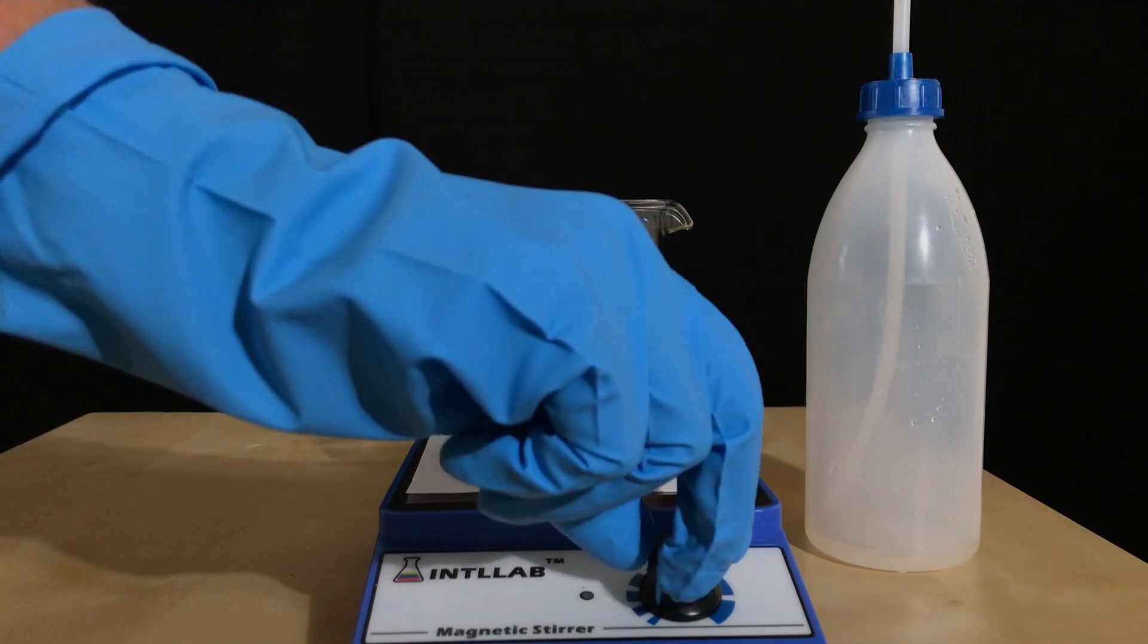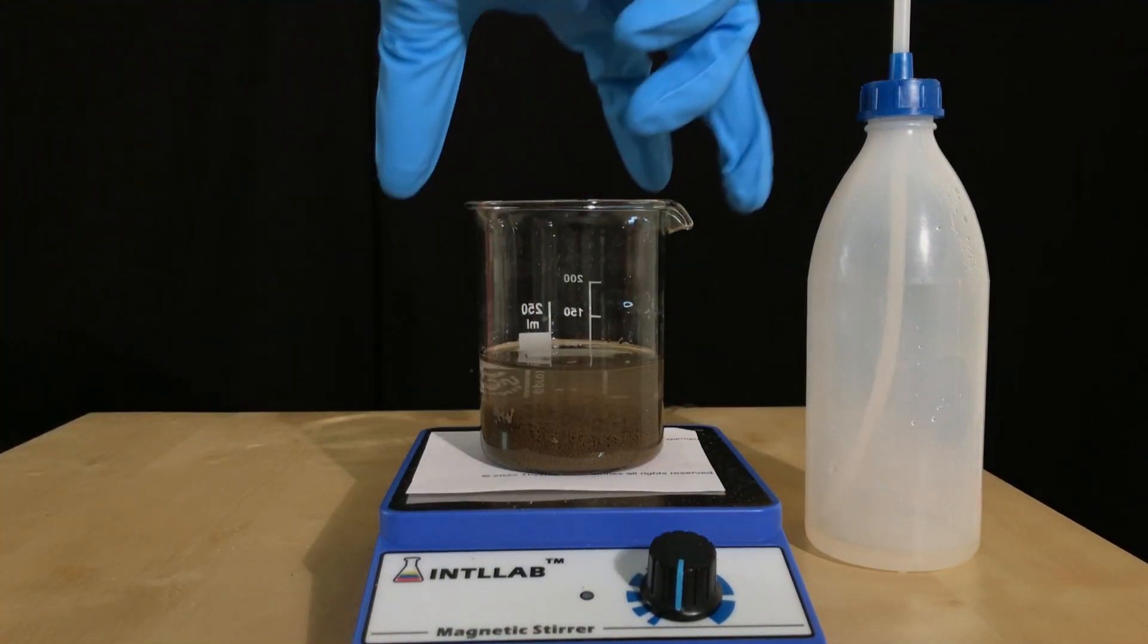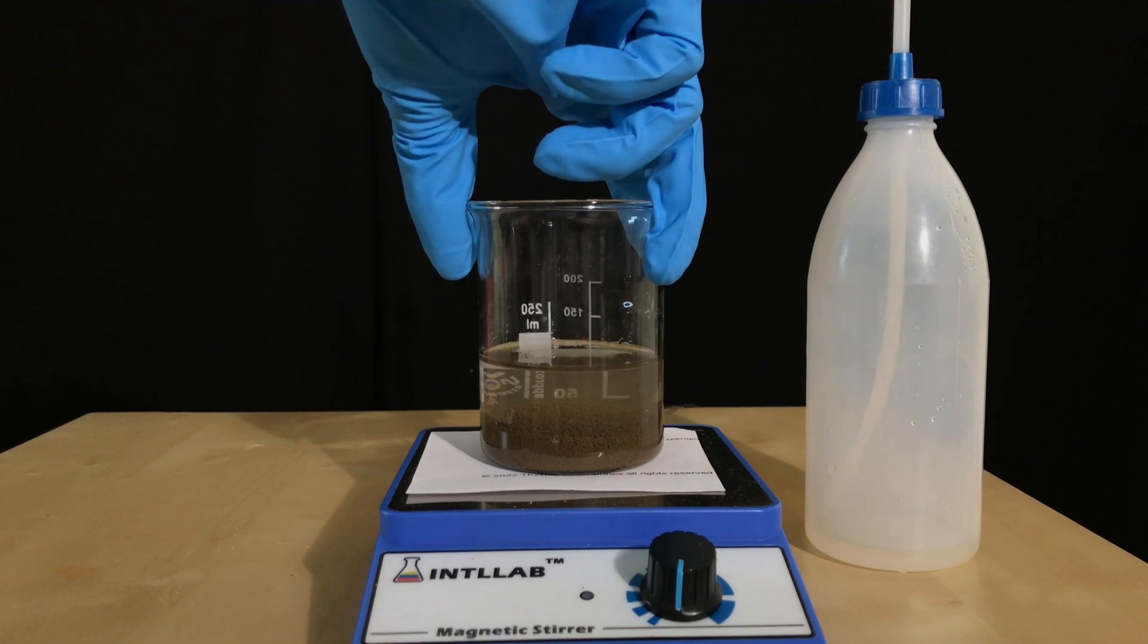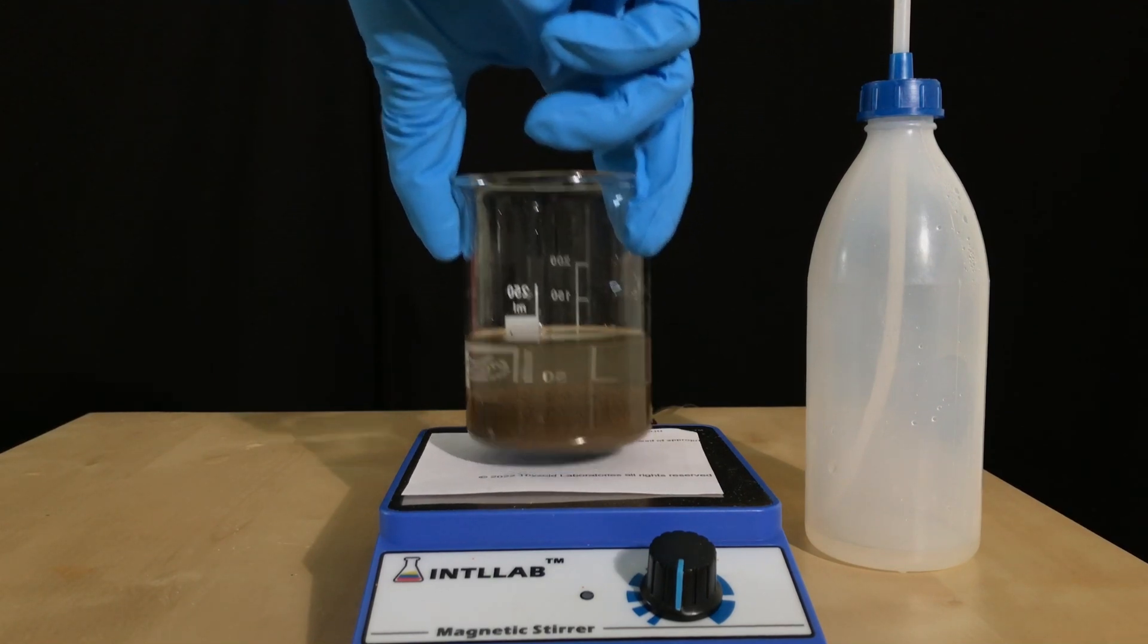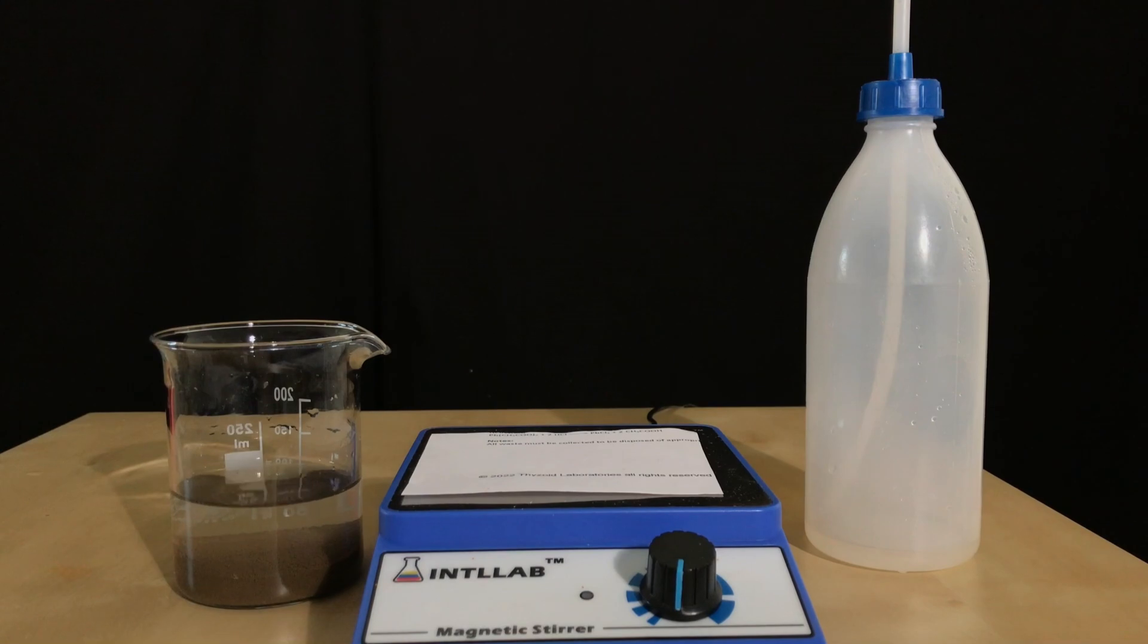10 minutes later, the magnetic stirrer was turned off and as you can see, the silver oxide quickly settled down. When I made mercuric oxide, it also settled down quite quickly and this reminded me of it.